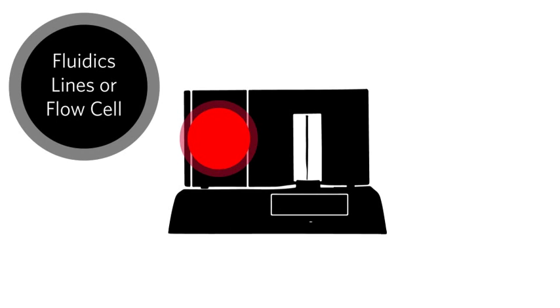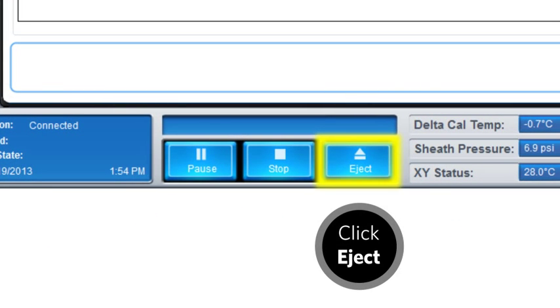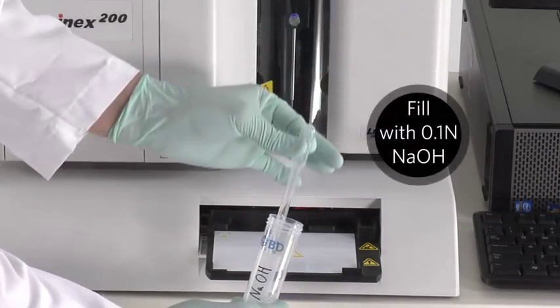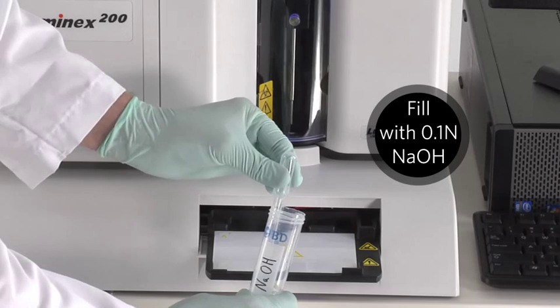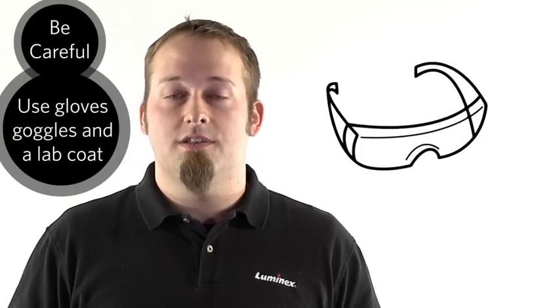If there is anything in the fluidics lines or flow cell of the instrument — from bubbles to crystallization of sheath fluid or debris — going through the following steps should flush them out of the system. From the Exponent 3.1 software, eject the plate holder. Fill the reservoir with 0.1 N sodium hydroxide. Be careful — sodium hydroxide is dangerous even at low concentrations. Make sure you have on your protective gear including gloves, safety goggles, and a lab coat. Retract the plate holder.